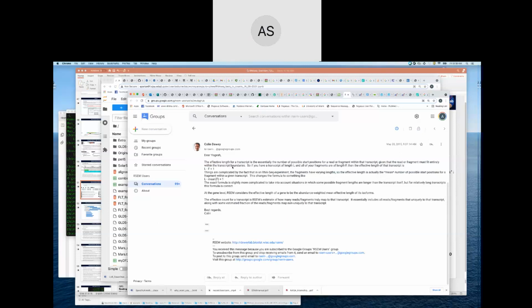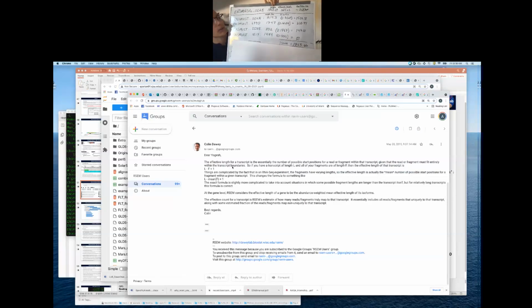Okay. So this length, I know it just says length here, that's a little misleading. This is actually a weighted length based on how much of each one of the transcripts are expressed. And so this transcript here, which also ends in 28, the same as the gene, that's going to be the transcript that contains all exons for this gene. And so the longest possible length for this gene's expression is going to be 2143.